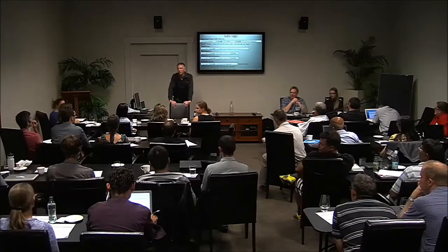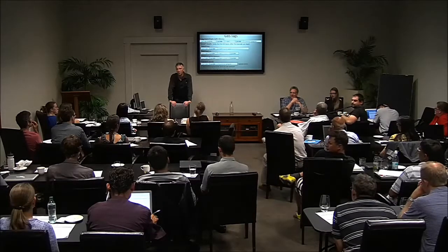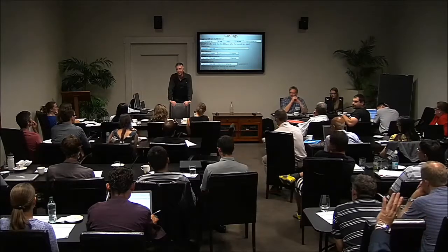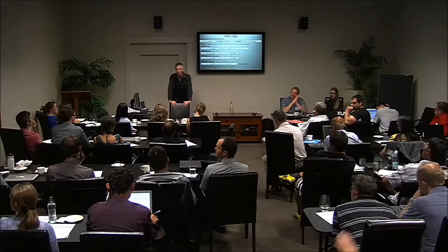20? Something around there, yeah. So I was just thinking about what Katie said about the error thing, and if you're allowing one mismatch, 1 in 20 is actually 5%. So if you're mapping and you're doing the network filter, you're taking 20, you're allowing one mismatch for that topology, that's actually 5%.